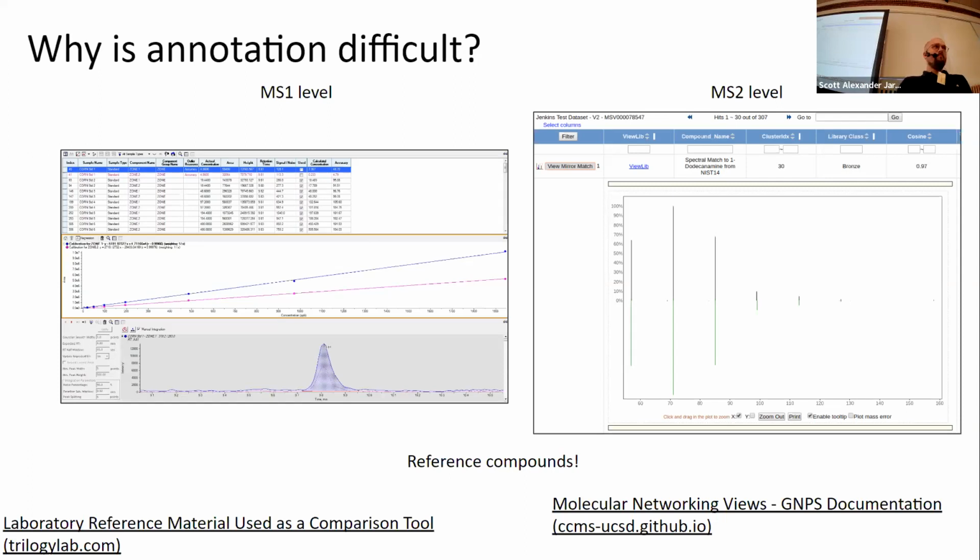But potentially through mining of papers, we can try to pull out some of this information, but because no journals have ever required you to deposit raw MS2 data, there's practically nothing else out there to mine besides the data that we can curate ourselves. So this is why the challenge is very hard, and why in untargeted metabolomics, it's routinely quoted that 99% or around there is unannotated or not able to be annotated at the moment.